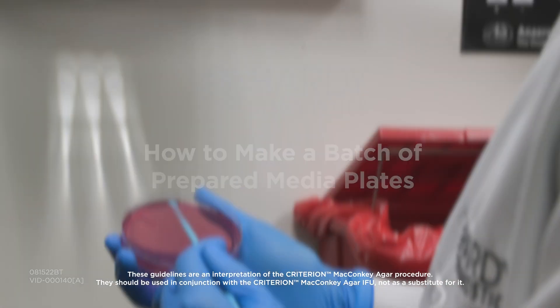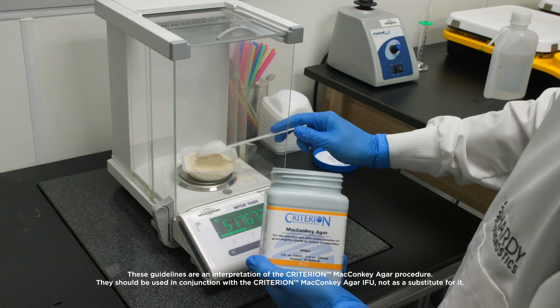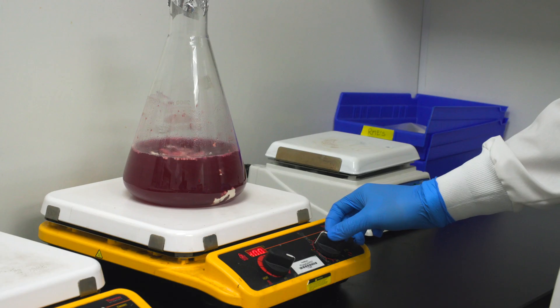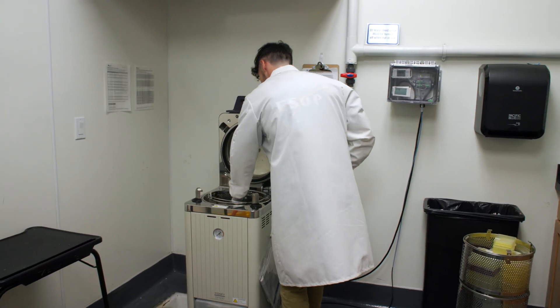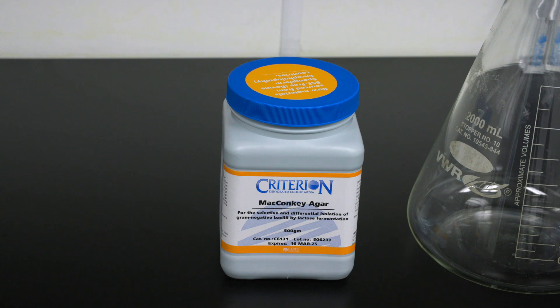In this video we will demonstrate how to prepare one liter of culture media. We will weigh out the powder, add the water, mix and sterilize in the autoclave, then pour into petri plates. We will be using MacConkey agar as an example.